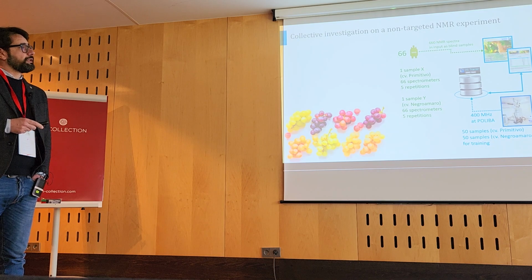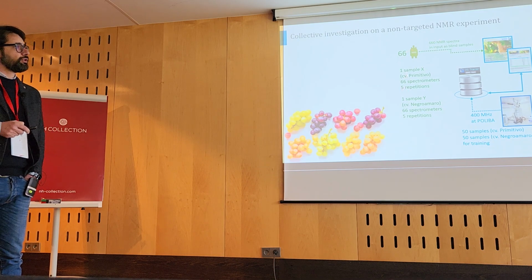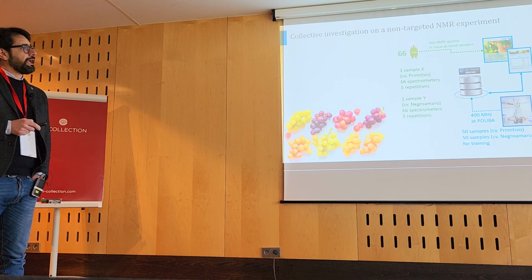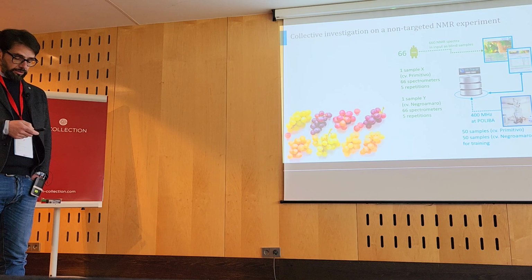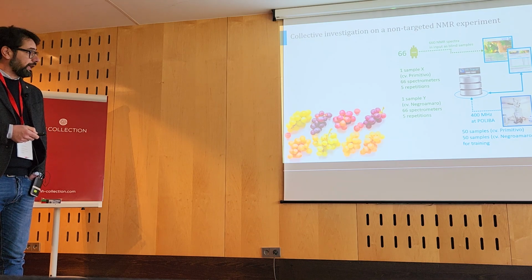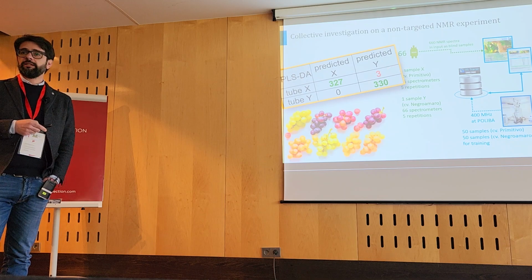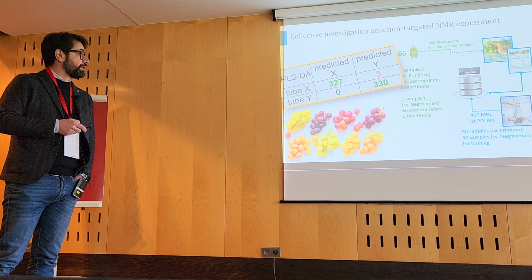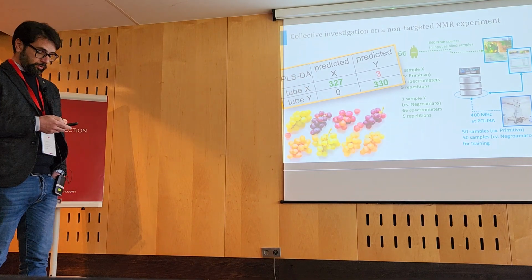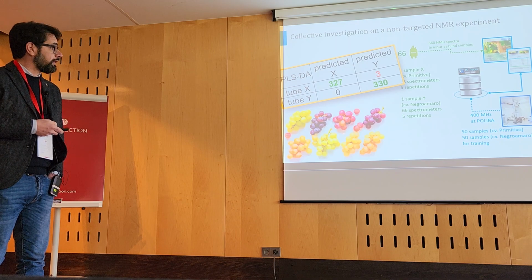And we used the spectra coming from the 66 spectrometers, 5 repetitions per sample, as blind samples. And we tried to see the answer of the classifier, and only 3 spectra were predicted in a wrong way. So we can be satisfied with these results.